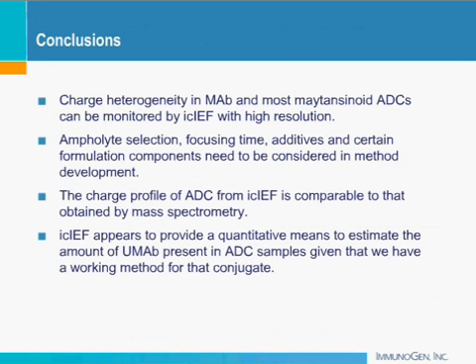And lastly, just going through the whole presentation, we looked at charge heterogeneity in antibodies and ADCs and how it can be monitored by ICIEF with very high resolution. We looked at how ampholyte selection, focusing time, additives, and formulation components need to be considered for method development.